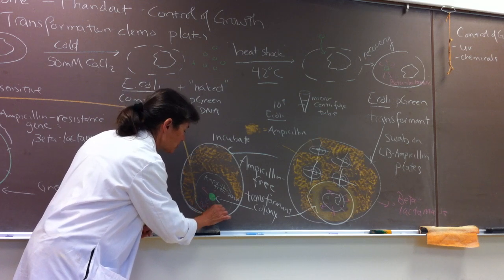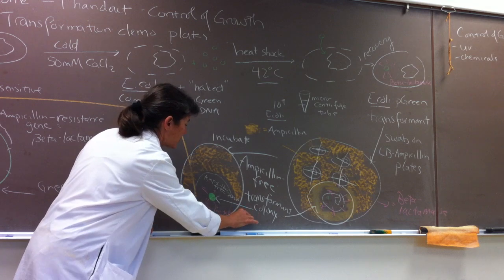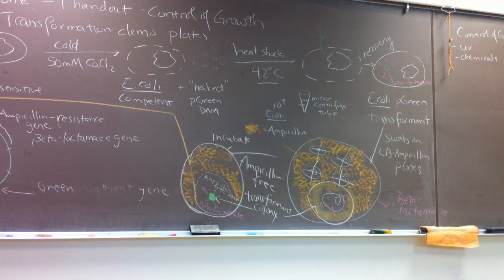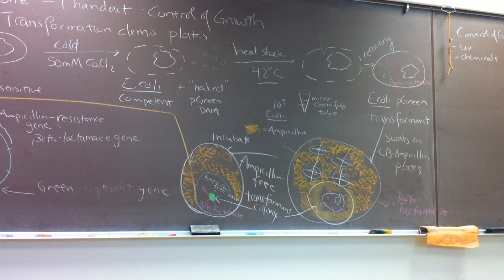Now, what is so cool, and you guys, I apologize, let me just see if I can find those plates, because there's the coolest thing going on with those transformation plates. So, if anybody finds a little tray, it's probably right here. They've got to be here somewhere. They are just gorgeous.